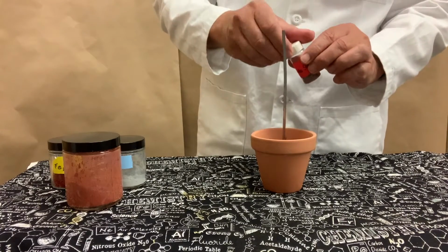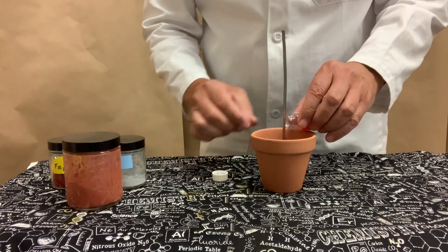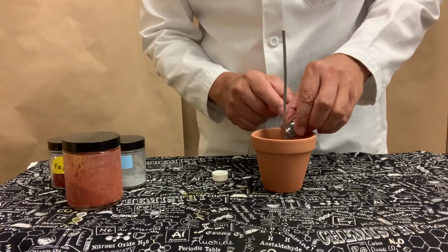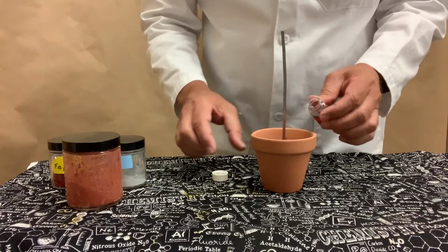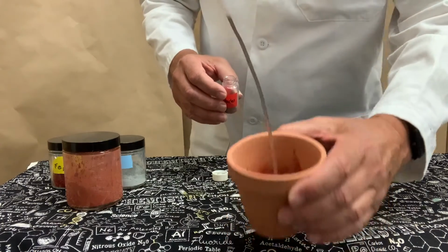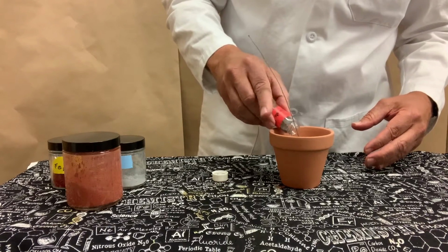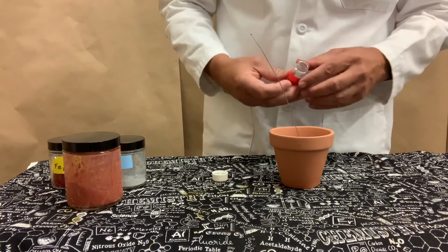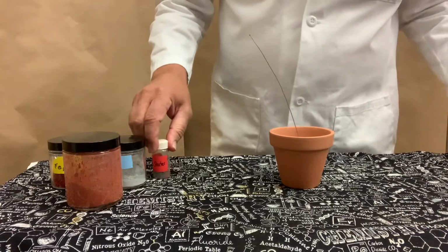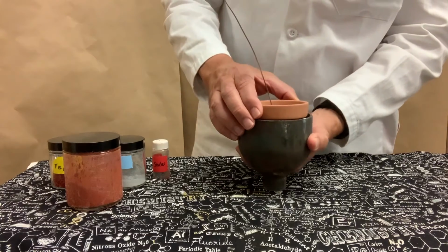Then I'll take some of the thermite starter, the barium peroxide aluminum mixture, and put it around the base of my magnesium wick. Magnesium fuse, I should call it. Then I'm going to place the whole thing inside of this steel secondary containment.